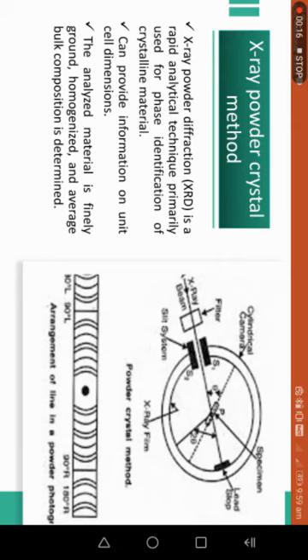X-ray beams passing through the filter, creating monochromatic light, fall on it and leave it as either diffracted or undeviated. The undeviated part will pass through this hole and the rest will create some diffraction pattern.